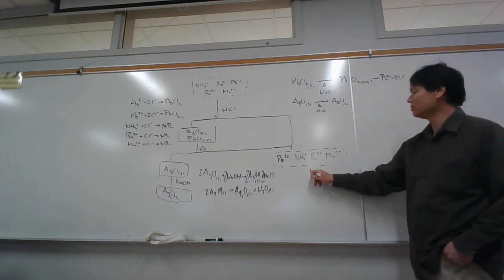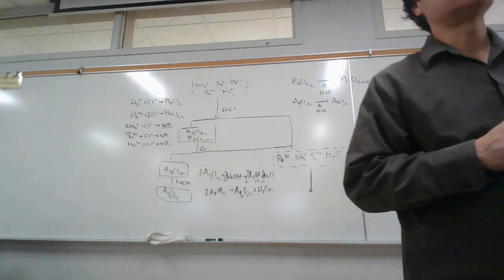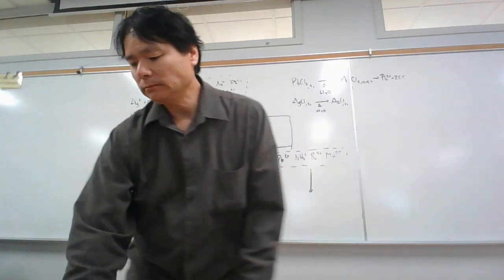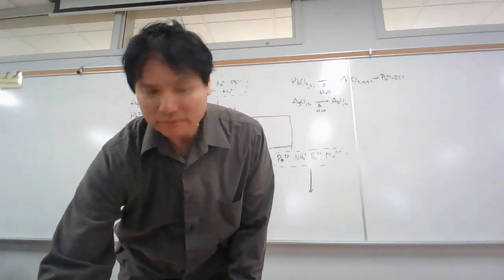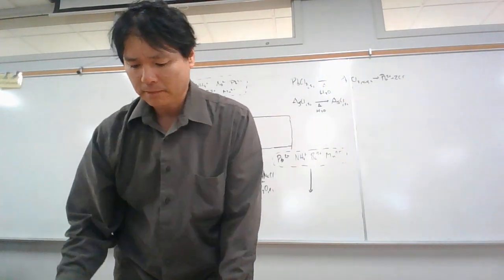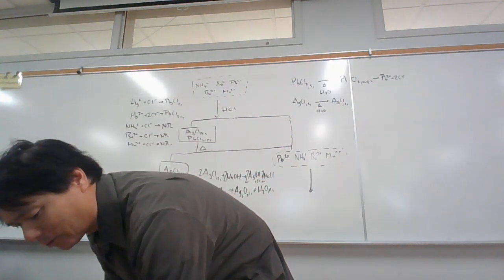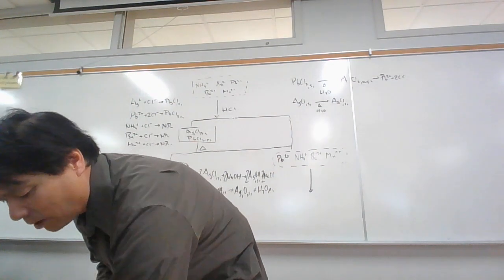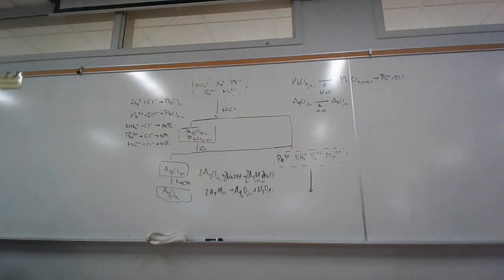Okay, then what are we going to do to this filtrate here? The filtrate is the liquid part of the solution. And so you'll either have a glass funnel or a plastic funnel when we do this. And normally what I use is a clay triangle to support the filter, or a small ring, or both. You know, actually we need both to do this. And then we just support it on a ring stand. So this is the filtration apparatus.